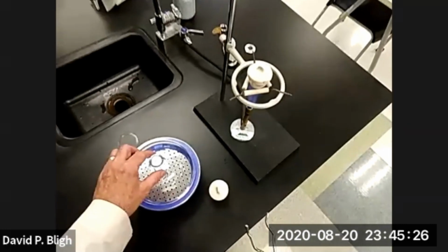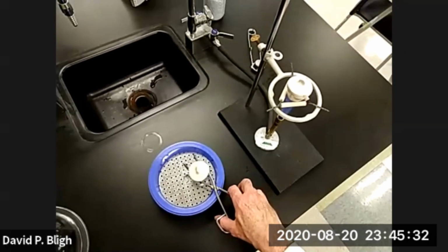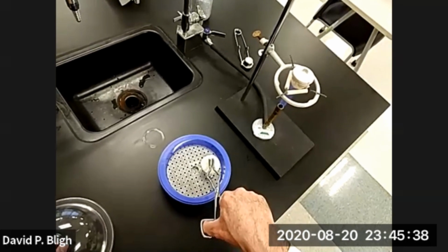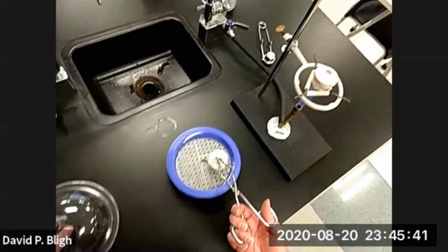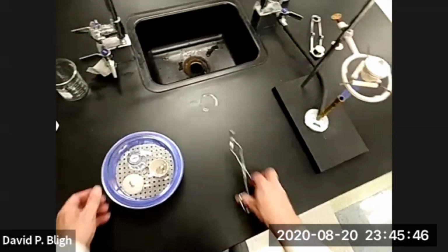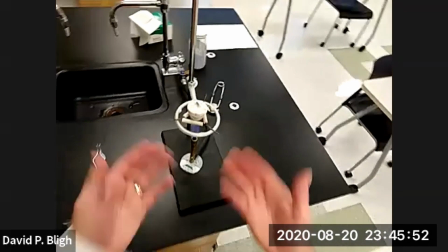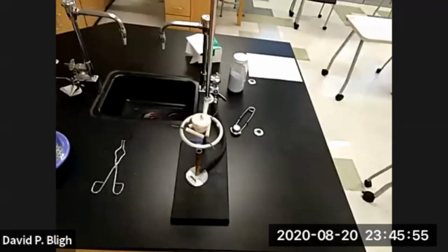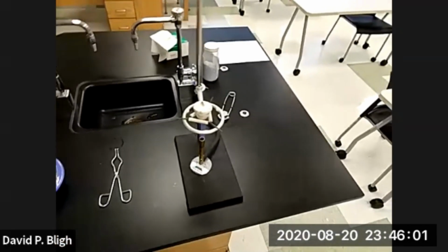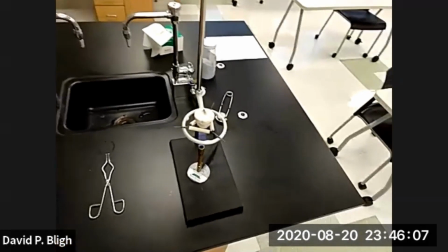All right, this one's cooled enough, I think. So let's move it into the desiccator. Take the lid off. Here we go. And we'll give it about 5 minutes, about half the time it takes to heat our copper sulfate. I don't know if you noticed, but I saw some steam coming out of that. It may not have been caught on camera, but there is steam coming from the material.